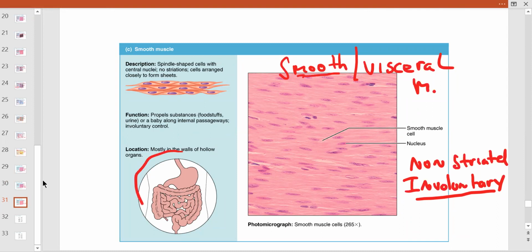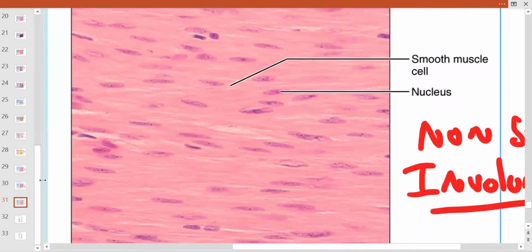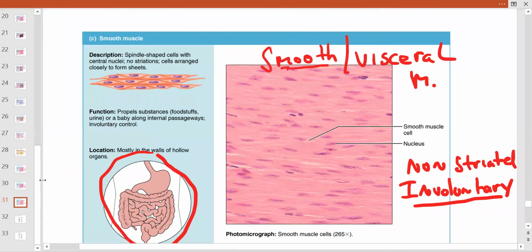They use the digestive system, which is true because you have to move the food through, and I'll tell you what that word is. So let's look close. Again, please, whatever you can do to help yourself differentiate smooth muscle histology versus dense regular connective tissue, because it's not easy. And these are muscle nuclei, and smooth muscle is not branched, but it's spindle shaped.